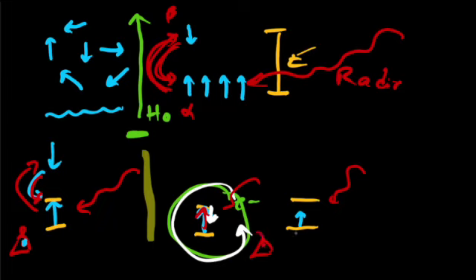So here's my little eyeball. Now that radio wave passes all the way through and hits my eye, my detector, then my detector says, oh, wait a minute, I see that radio wave. It must not be flipping, because if it flips, I don't see any light, and it knows that it's not flipping. So here's what we do.